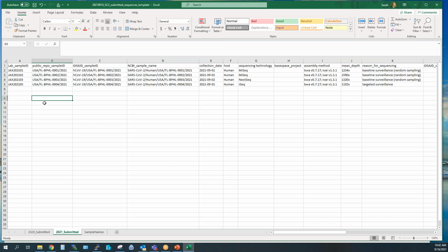It needs to know what it's going to do. It's automatically going to rename all of your FASTA files for you, all the headers and everything. It's going to change it from whatever your lab name is to the public name, and does that automatically for you. GenBank has a limit, you can do 1,000 genomes at a time. So if you had 1,000 that you were preparing, it would rename all 1,000 genomes all at the same time using the same script.